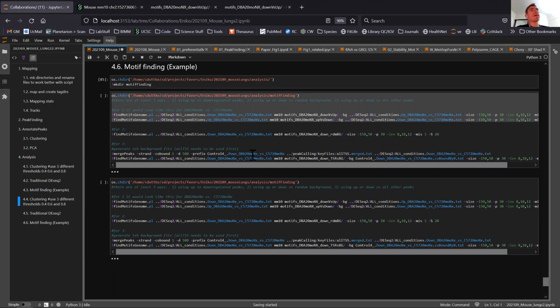And the third one, which I actually commonly like to use, is I just take all my peaks and then subtract from all the peaks those ones that are enriched, which is just done by this co-bound command, give it a prefix, and then here it's important to use the cobind 0. When you do that, it makes sure that the peaks that have all of them is first.